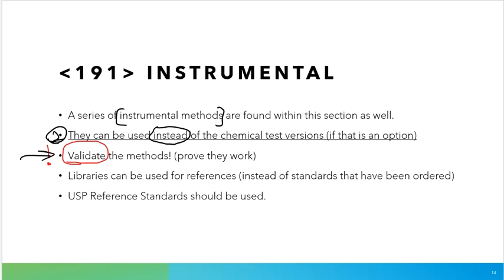Then after that, you can run these samples that are submitted to the lab where you have to report, is there sodium present, yes or no? Because those are unknowns. You don't really know what those are. Or they're sent to you with a name and you think you might know what they are because it's on the label, but you're confirming that that label is correct. You're confirming that what's on the inside is actually what's supposed to be present. So that's the term of validation, making sure the instrument's working the proper way, and often you are using a standard in order to complete that validation process.